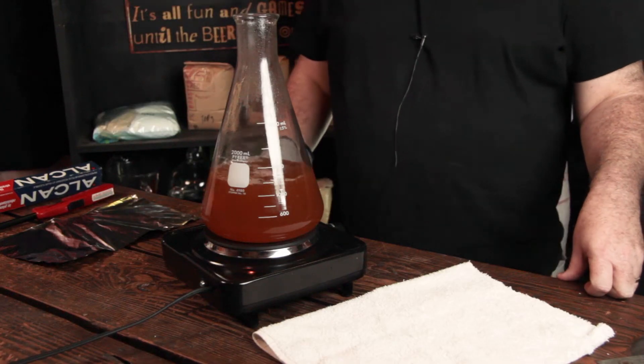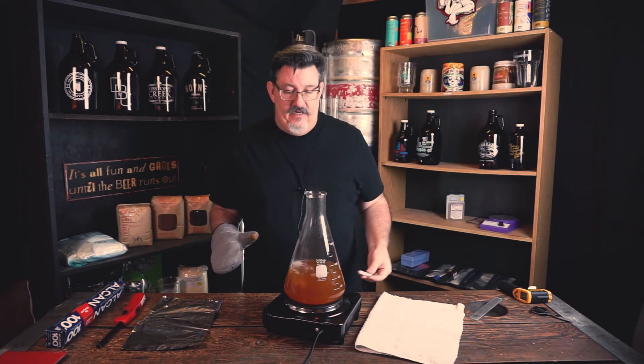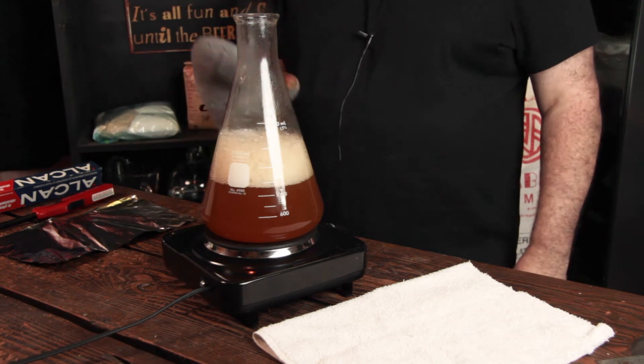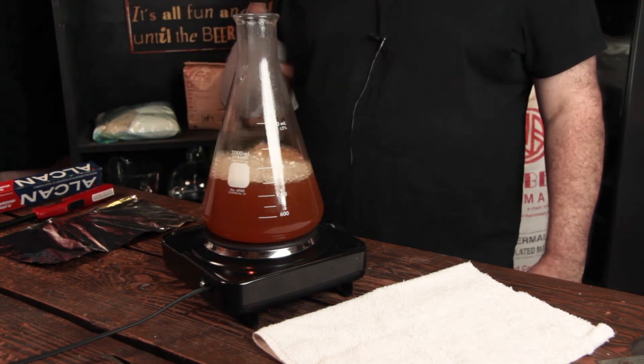We've got a nice little boil going. One thing that's important: if you use a stir plate, you've got a stir bar. The stir bar can either be sanitized in a bucket of Star San before you toss it in, but like a lot of people I just tend to drop it in during the boil. You notice the bubbling? That's something you have to be aware of.